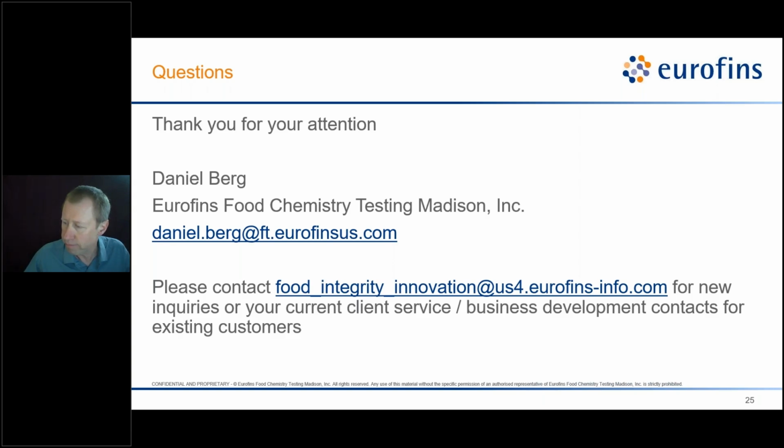Great, thanks, Dan. We have another question here from the group. What do I do if I use multiple protein sources and want to claim a % daily value on my label? Okay, so if there's multiple protein sources, we need to consider that in the protein digestibility. It doesn't matter for our amino acid score. Regardless of all the sources, we're going to measure for amino acids all the same.